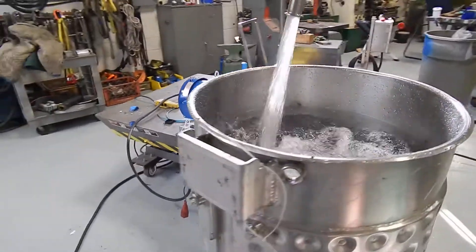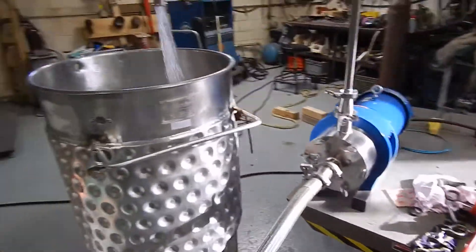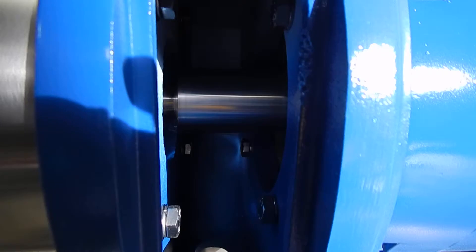The unit has a real strong pumping action. You'll see that the unit is mounted about the water level in the tank. We're looking to make sure we have no leakage in the seal here, and everything looks really good.